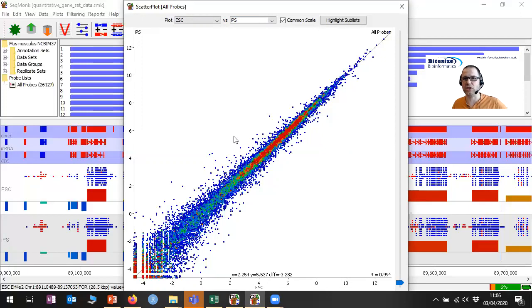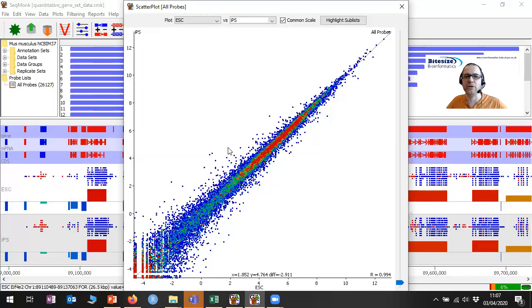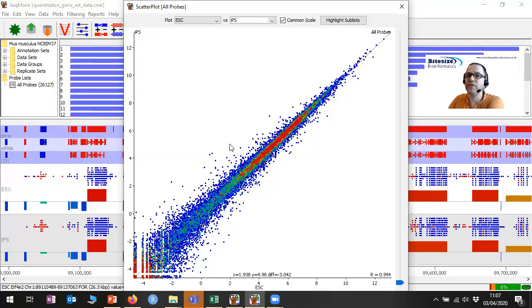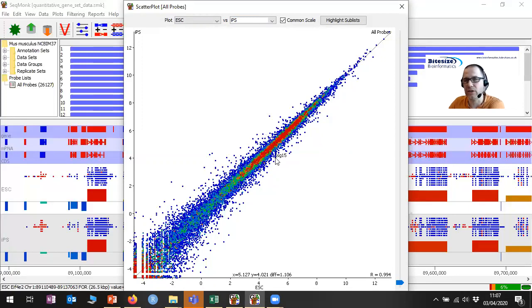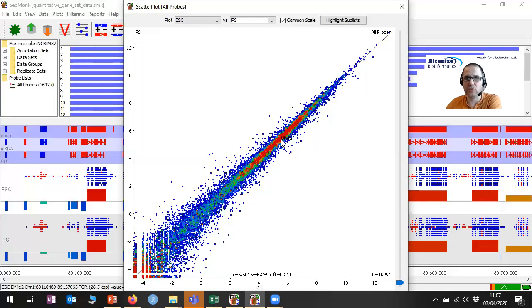You can test the whole set all in one go, so the power you have to detect changes goes up quite a lot. Even if your data is not amenable to finding a change in an individual gene, because you're testing a set, you can detect more subtle behaviors than you could possibly have hoped to detect by pulling genes out individually. In practical terms, we are going to look for functionally connected gene sets that don't just position themselves randomly within the scatter plot — they'll sit preferentially towards one side or the other, indicating that the set is functionally interesting even if the changes are relatively subtle.